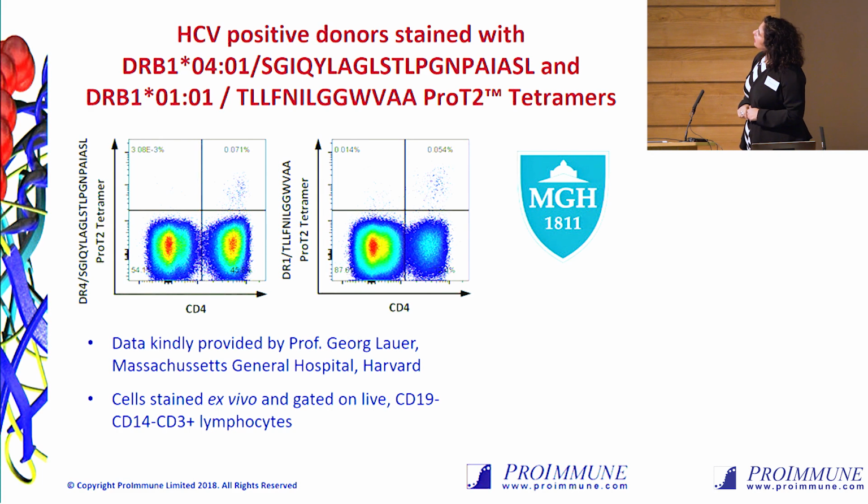As you can see, I always like to mention the low numbers, which are 0.054%, and that's definitely not background. This is just how small the populations are, and it is what it is. You shouldn't be scared of seeing such small numbers. All you have to do is make sure you have the gatings at the right position.